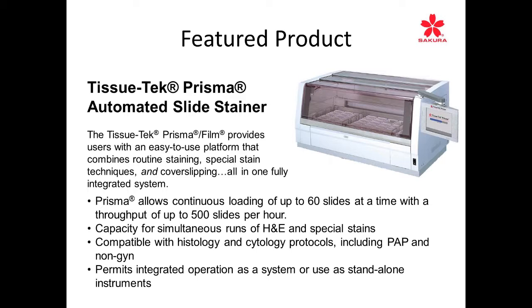I don't know of any method of actually avoiding the red blood cells picking up the stain. There may be some, but I'm not aware of any. It's just something that you have to be cognizant of and aware of through the morphology. That's why one of the things that we always stress is that the histotech visualizes the special stain before they take it out to the pathologist.